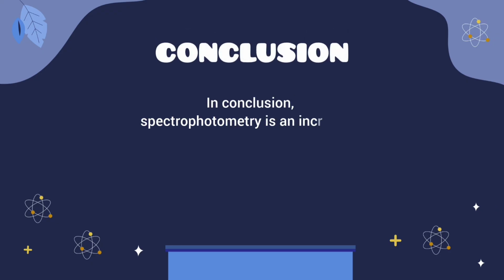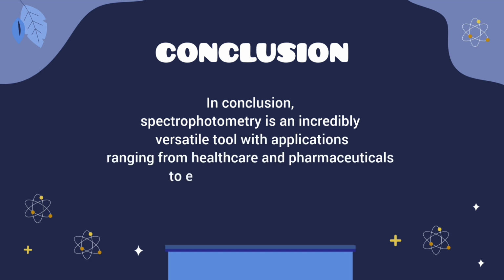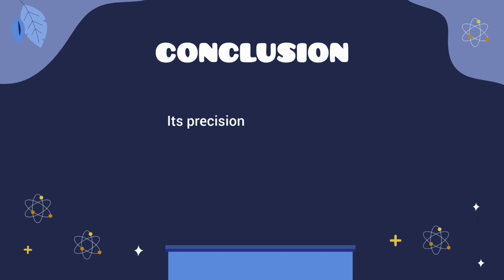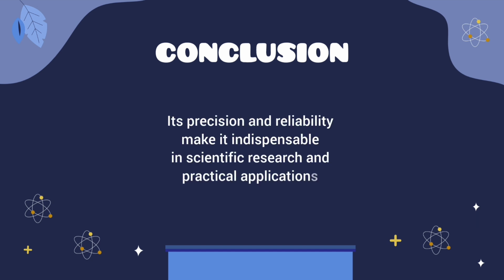In conclusion, spectrophotometry is an incredibly versatile tool with application ranging from healthcare and pharmaceutical to environmental science, food analysis, and molecular biology. Its precision and reliability make it indispensable in scientific research and practical application.